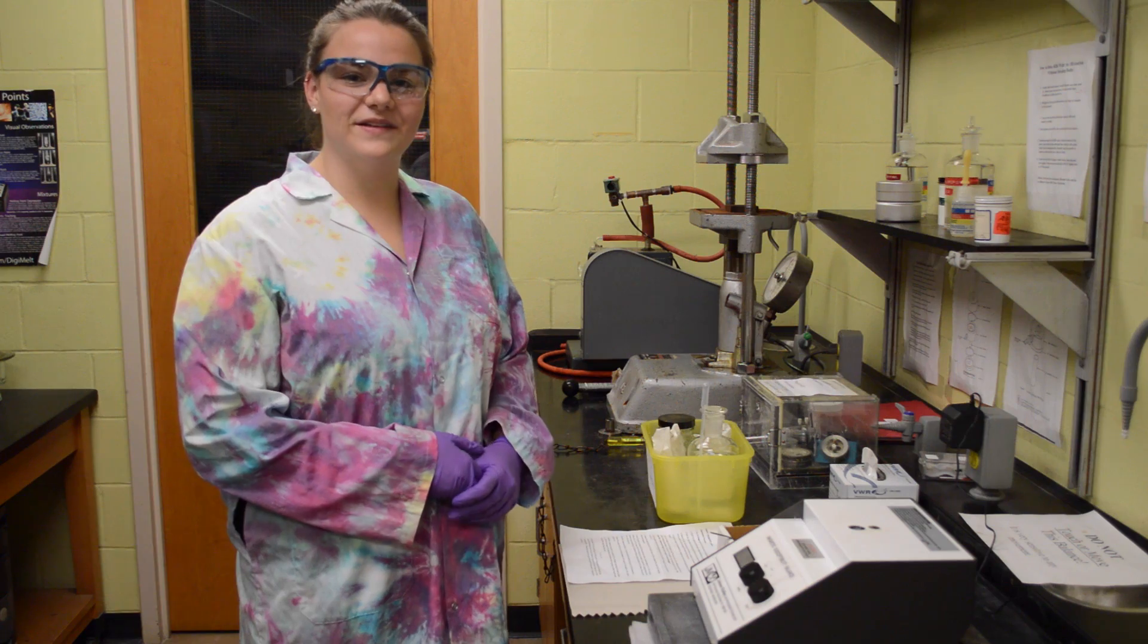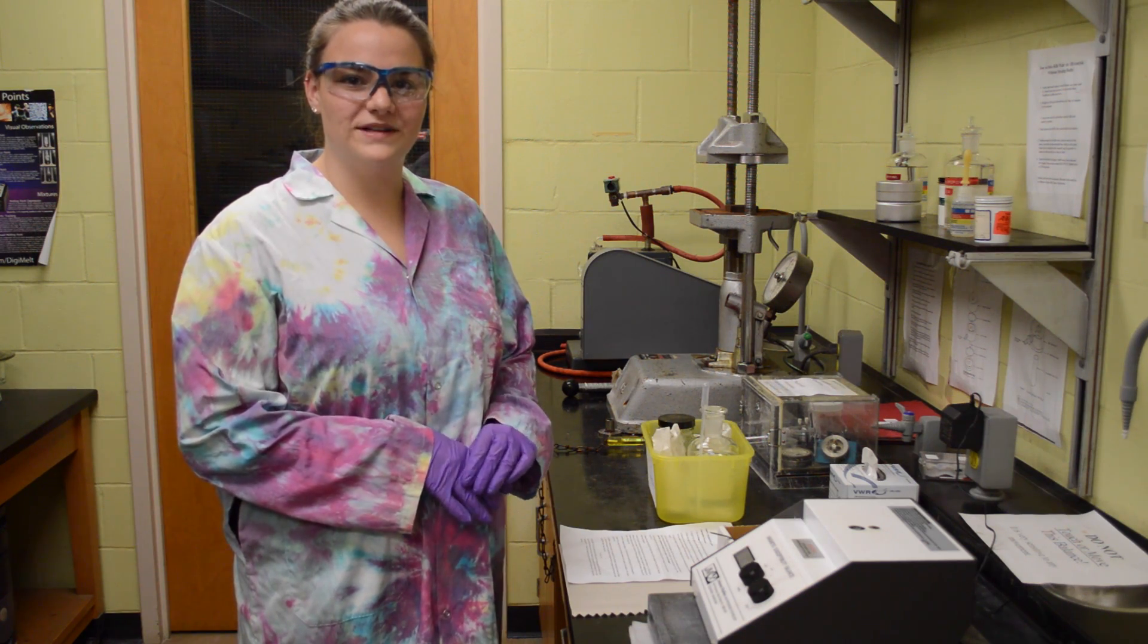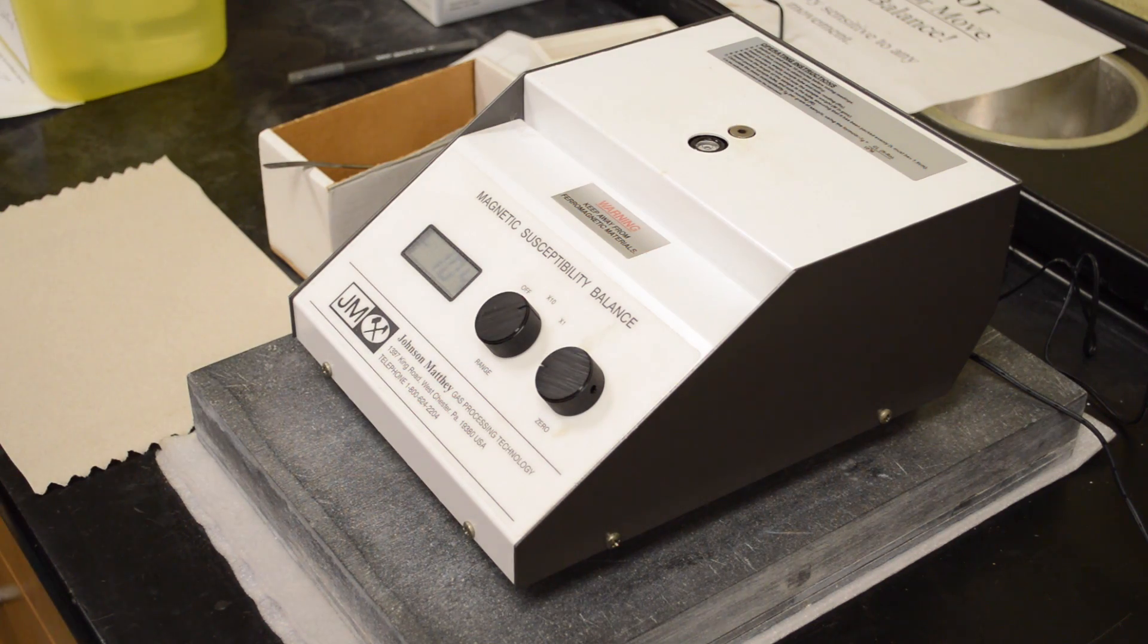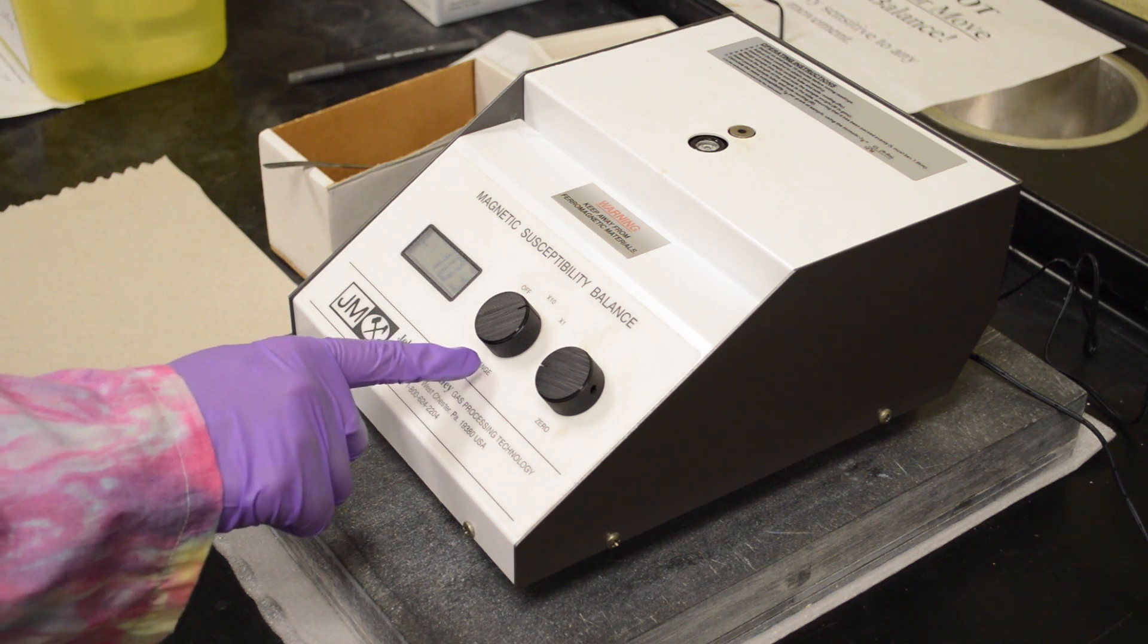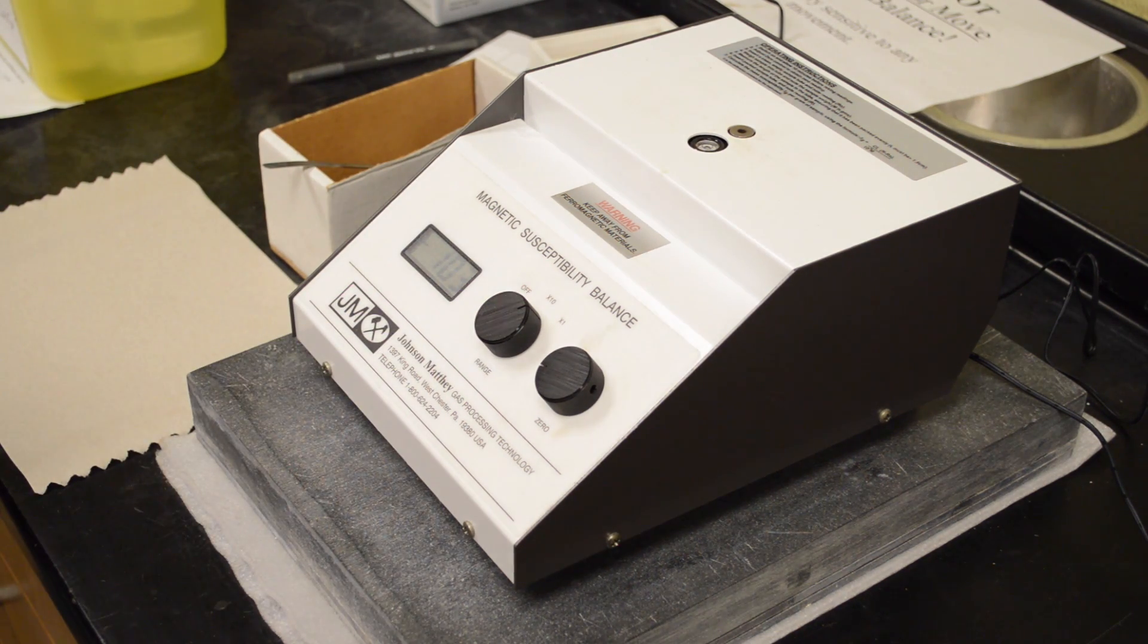The magnetic susceptibility balance is used to determine the magnetic properties of a compound. First, turn on the range knob to the 1x dial here, and let it warm up for 10 minutes.